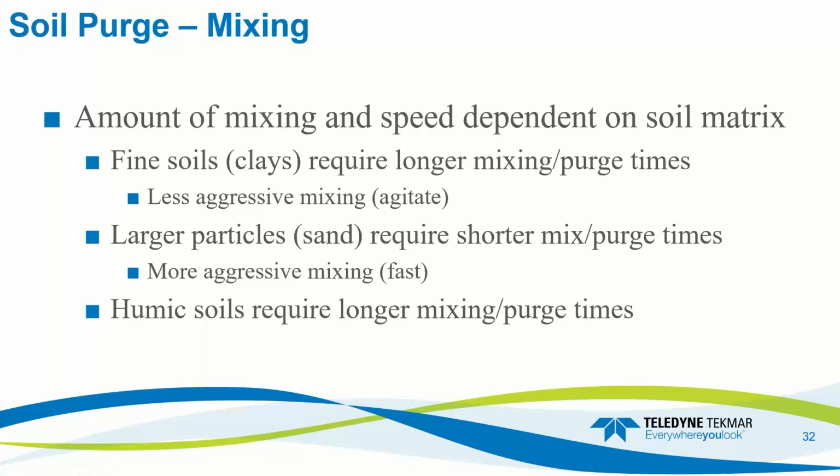For soil samples, the amount of time for mixing and the speed is really dependent on the soil matrix. For fine soils or clays, they require longer mixing or purge times with a less aggressive mixing, possibly an agitate. And larger particles like sand require shorter mixing or purge times with more aggressive mixing, like a faster speed. And humic soils require longer mixing or purge times.